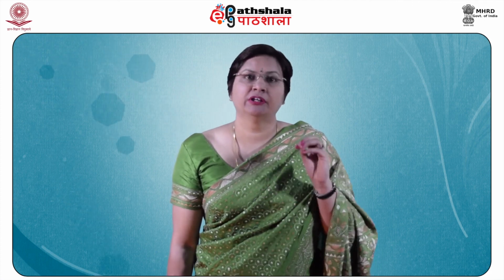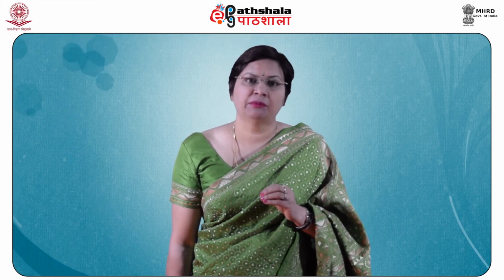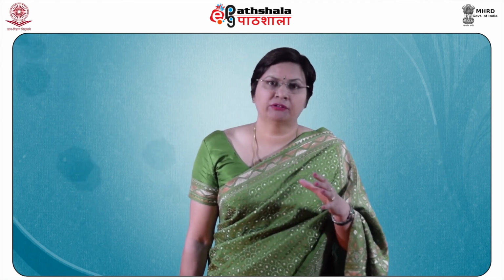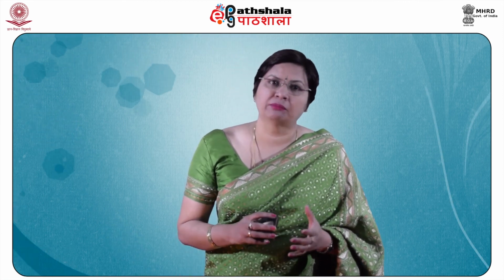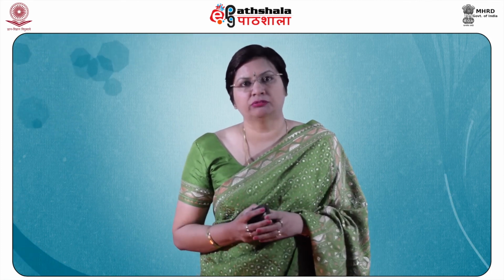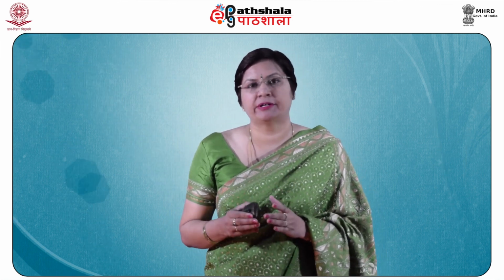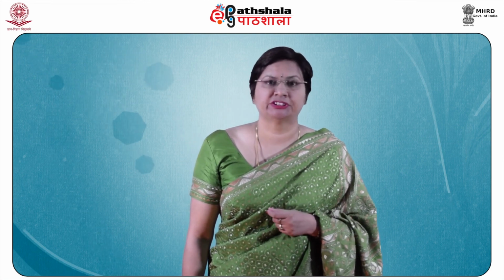The IR spectra will give you information regarding what functional groups are present in the molecule. The 1H NMR will tell you the number and environment of the neighboring hydrogens which are present in that particular molecule. The 13C NMR will give you information about the type of carbon atoms which are present in that particular compound, and the mass spectra will give you the information about the total mass of the compound, as well as the fragmentation pattern, from where it can fragment and what different peaks you get, all of that you can derive. So, by combining all this information, one can easily find the structure of the molecule.